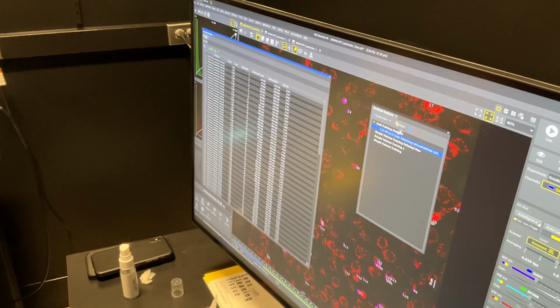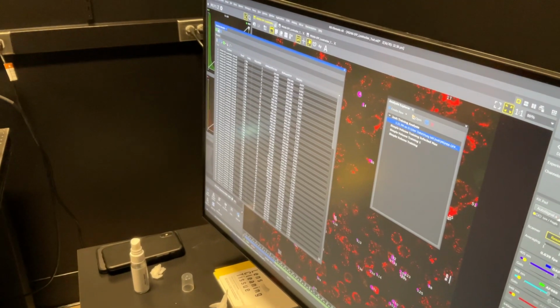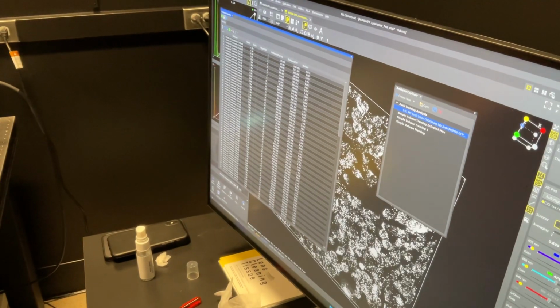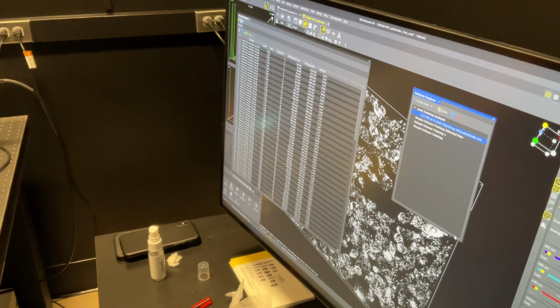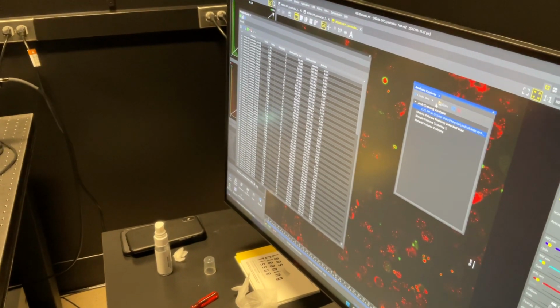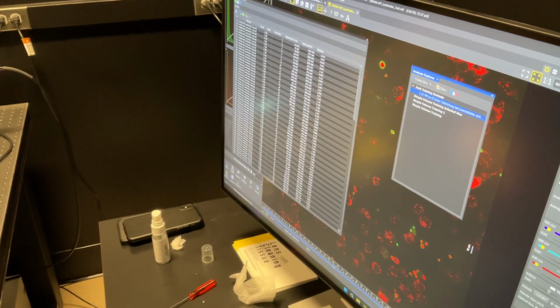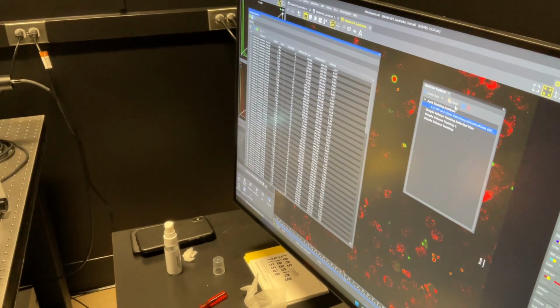So here you'll see that it gives you a run, and then let's say this image is closed. Close that. Let's not save anything to it for now. But then if I choose that, I can hit open. Probably because we didn't save it. That's my bad. Open will open the file that it ran from. Gotcha. And then if we ran it again and saved it, hitting this would pop open. Ah, there we go. I did save it.